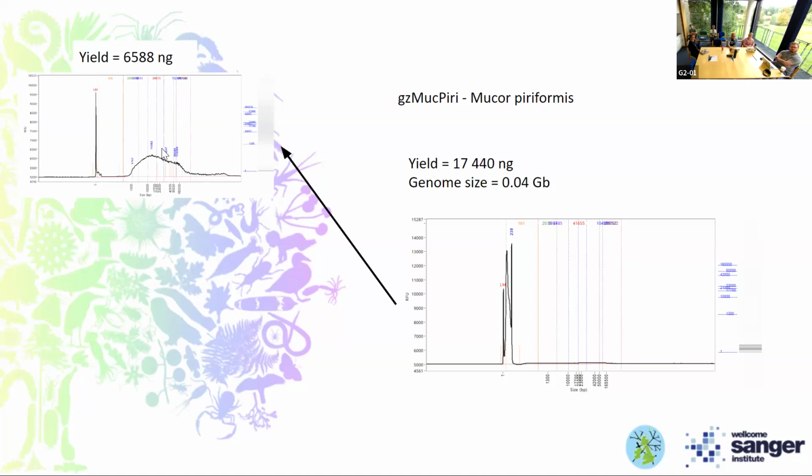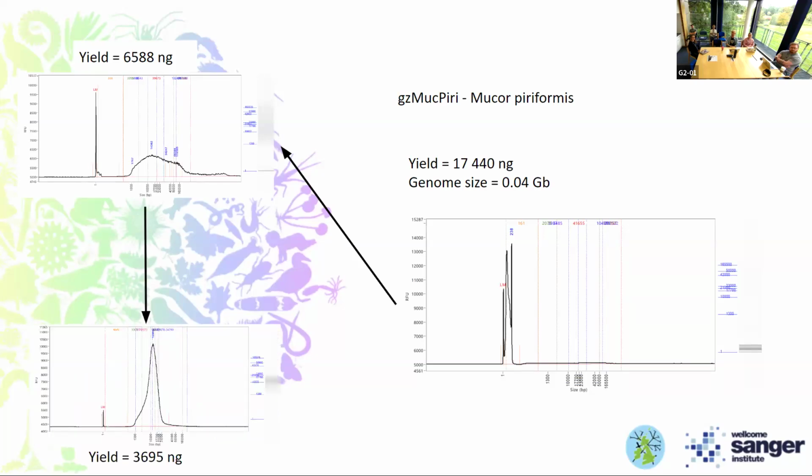This is sitting within an average fragment size of 38 kb. So something we could definitely work with and try to fragment for either a standard library or ULI library. And it's something that we did. We were able to send this DNA through the Megaruptor and produce sheared DNA of 3,700 nanograms of good quality, or good fragment size distribution, for PacBio library prep.